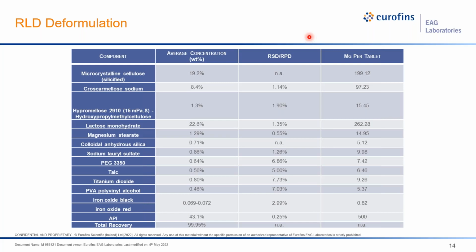As you see with the RSD and RPD section, these errors can be associated with these different percentages. This is basically our precision. And as you can see, what if one of these materials is 1% high and another's 1% low? Just think of it in that regard. Well, it still adds up to 99.95, but you're a little off. That's why we have the matrix spike. That's why we have these other parameters to look at.